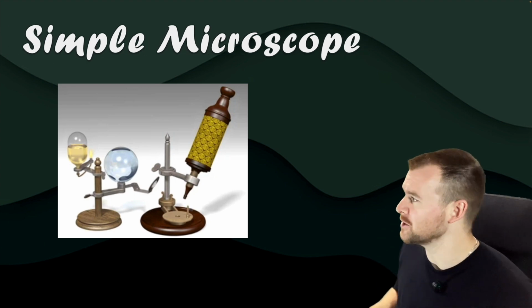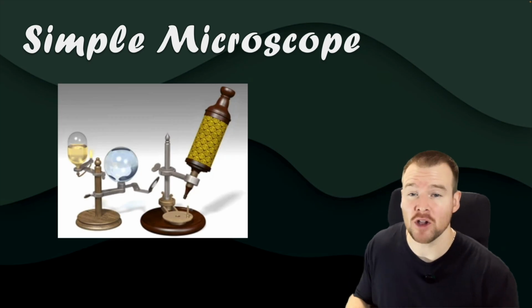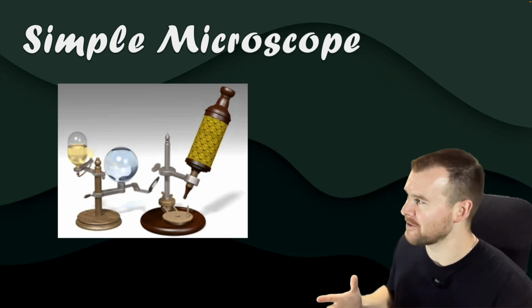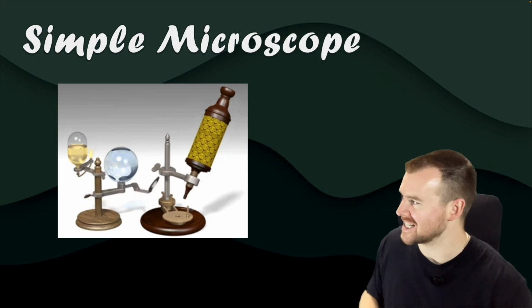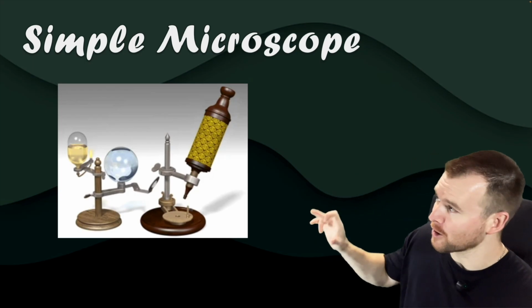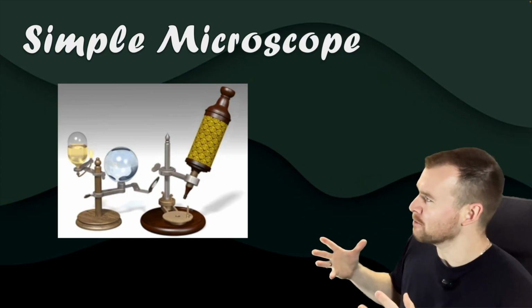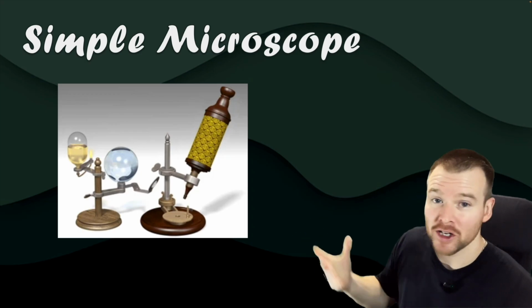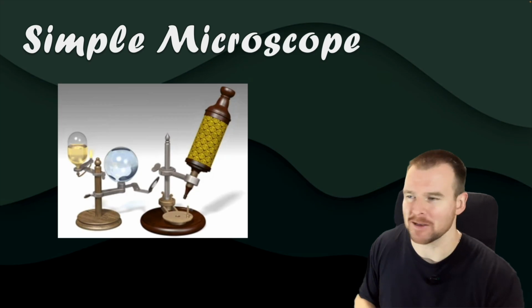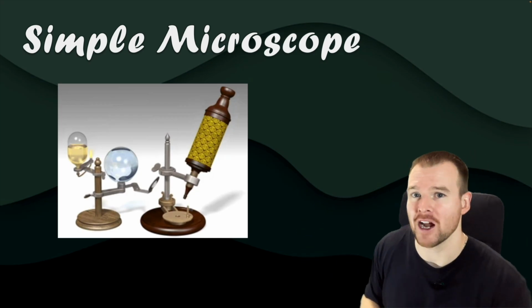And this microscope was used a long time ago. It was used by Hooke and Leeuwenhoek using just one lens. As simple as it is, it's a really interesting setup where we've got this microscope-looking part over here, but then the light source over there with a lamp and then a ball of fluid or a ball of water here to focus that image down, or it could be a ball of glass, but as I've seen in some research, they actually used water to try and focus that light there to make it bright on the image.